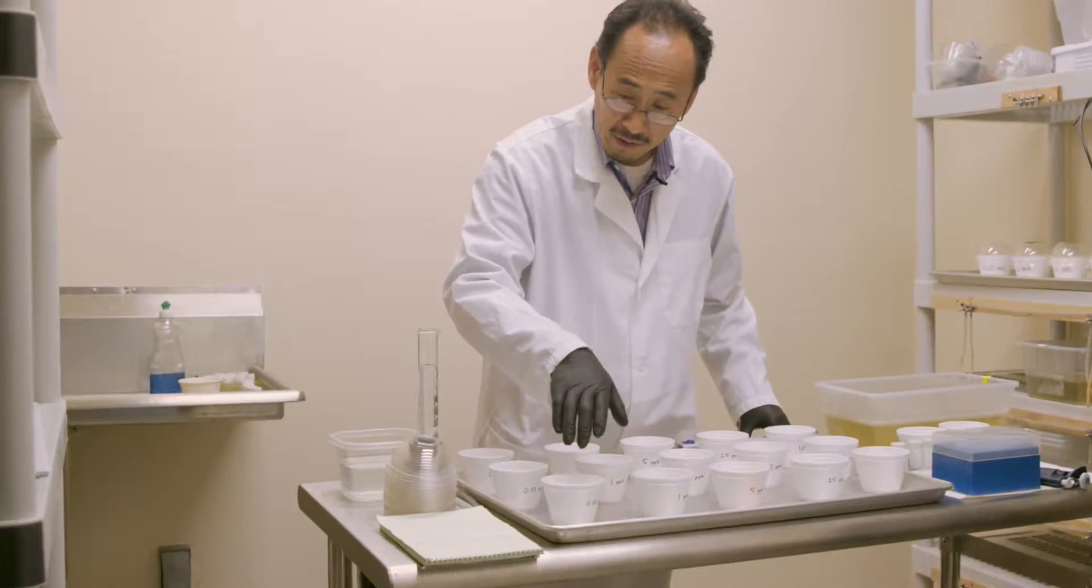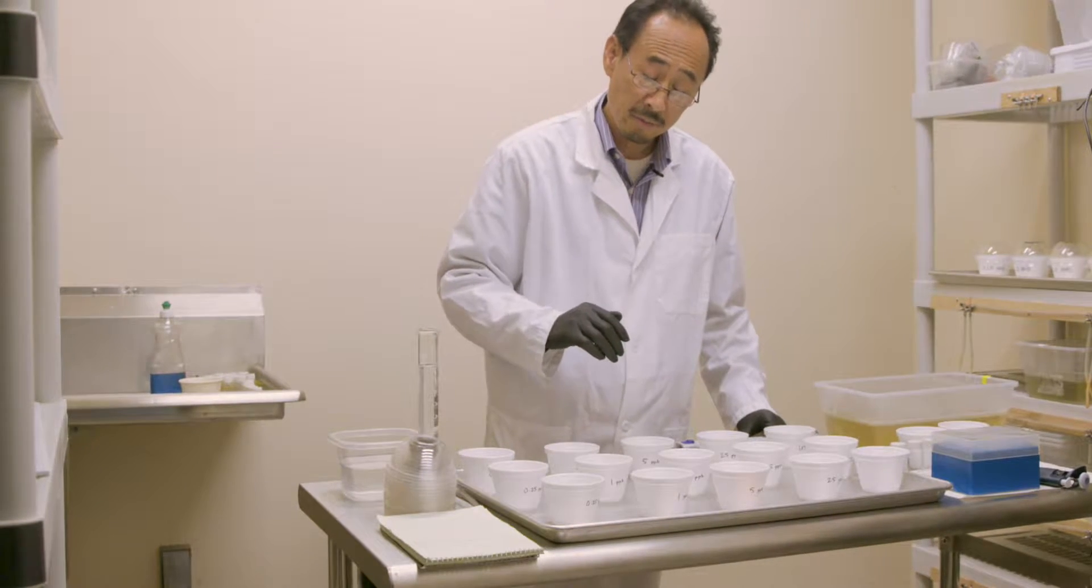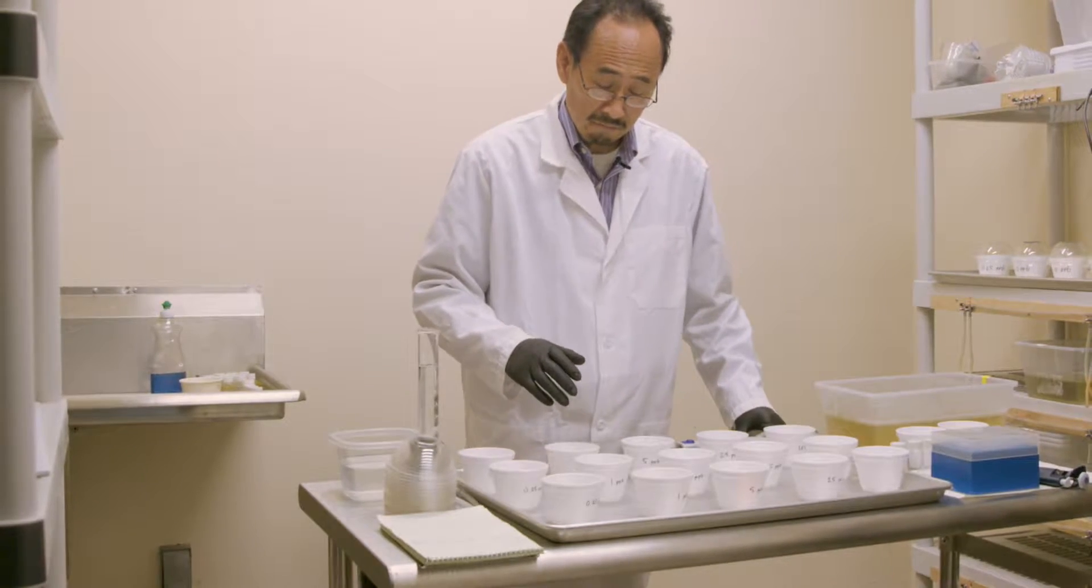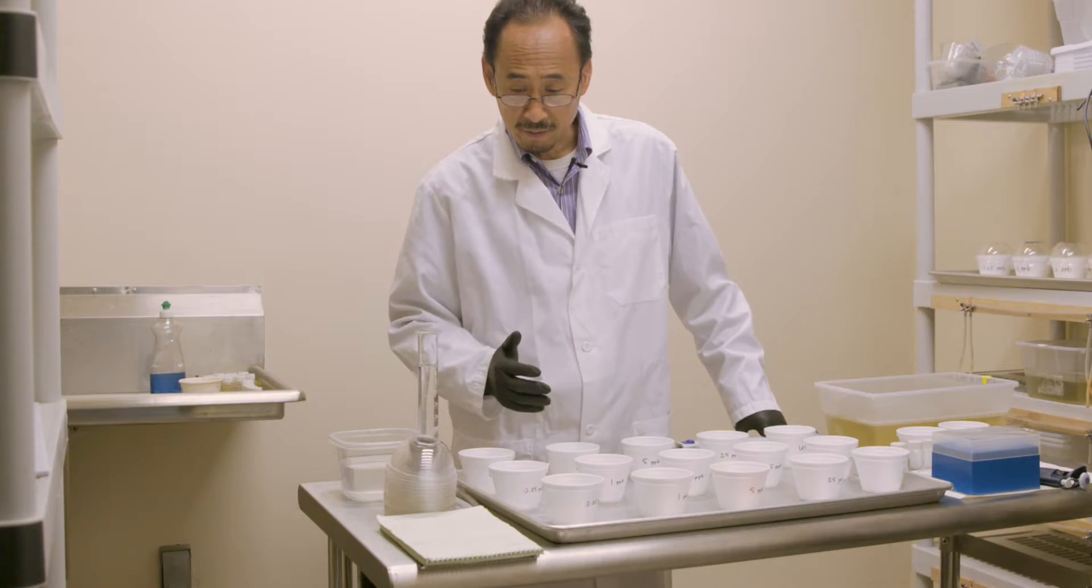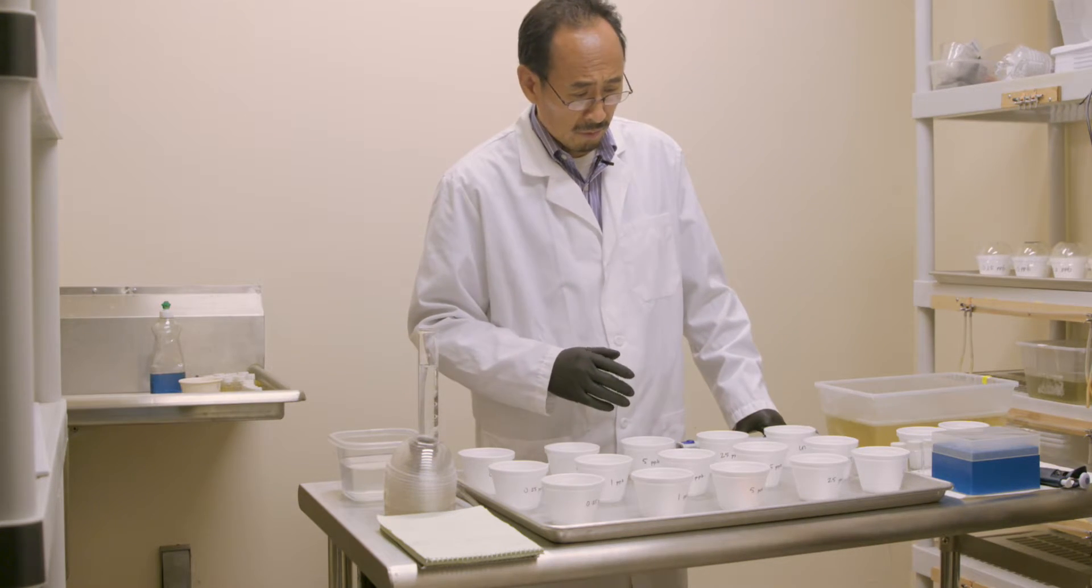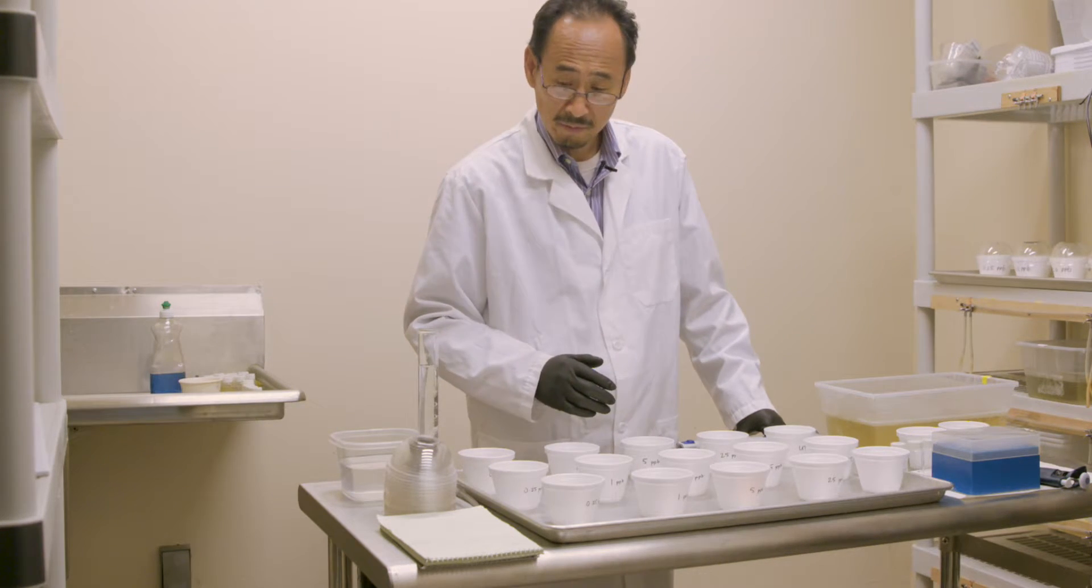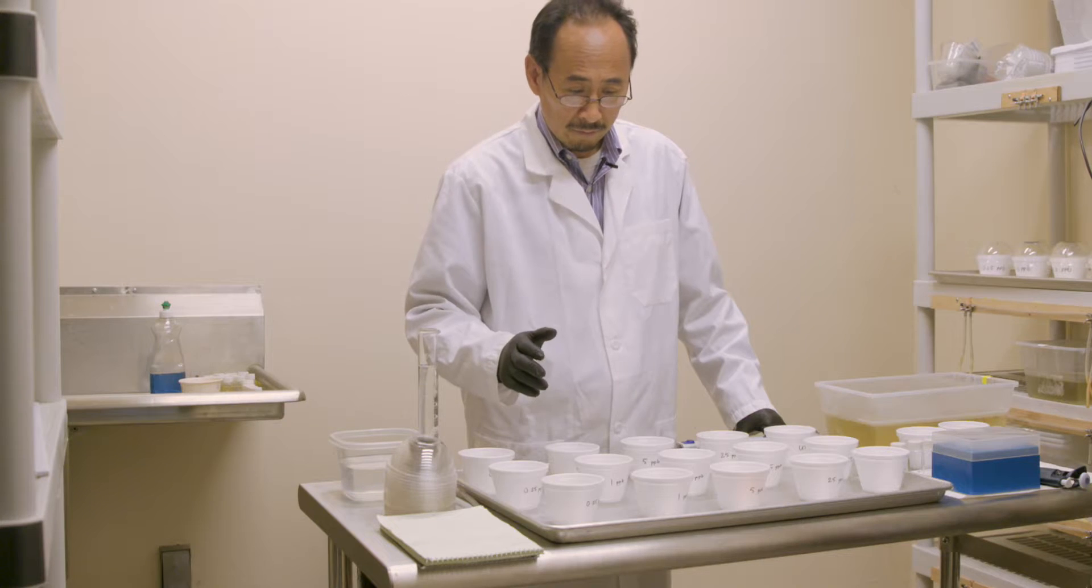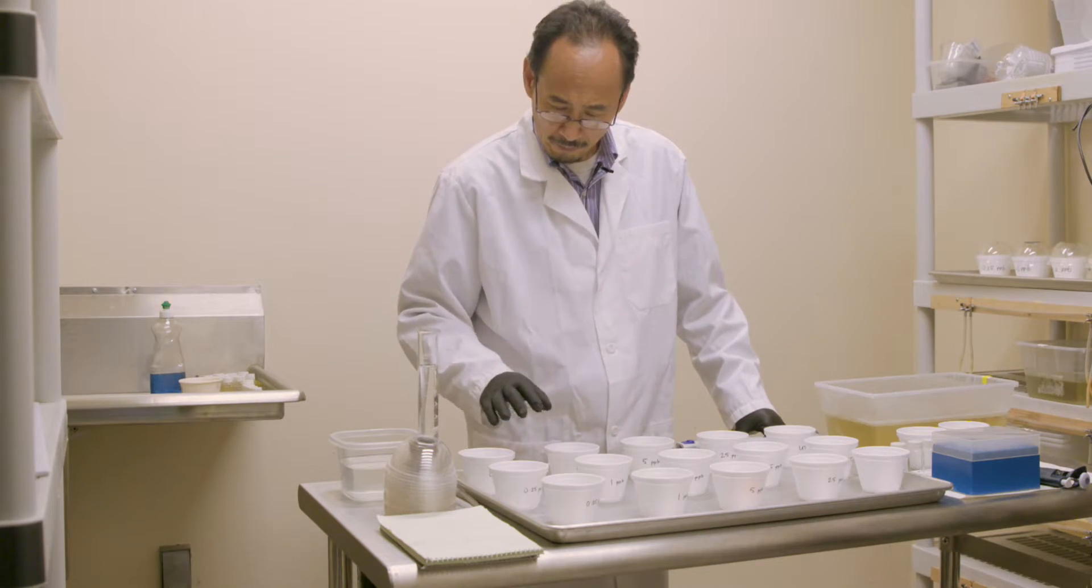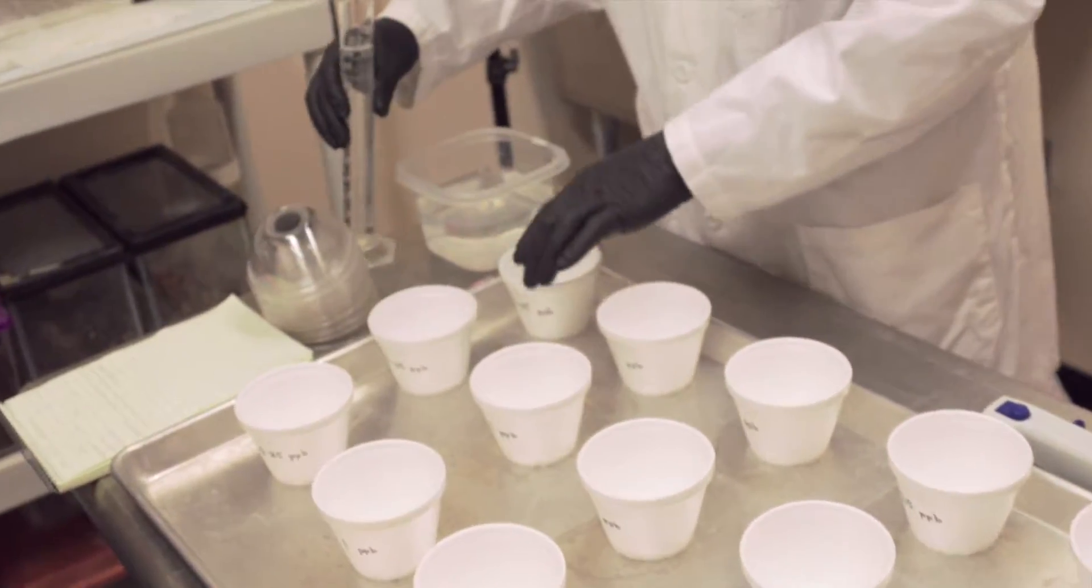As you can see, the range here from 0.25 to 25 is 100 times. For BTI and spinosad and any other larvicide which kills larvae quick, you mostly use a range like five-fold maximum. But this one, the range is much broader. You're going to add 100 ml of water per cup.